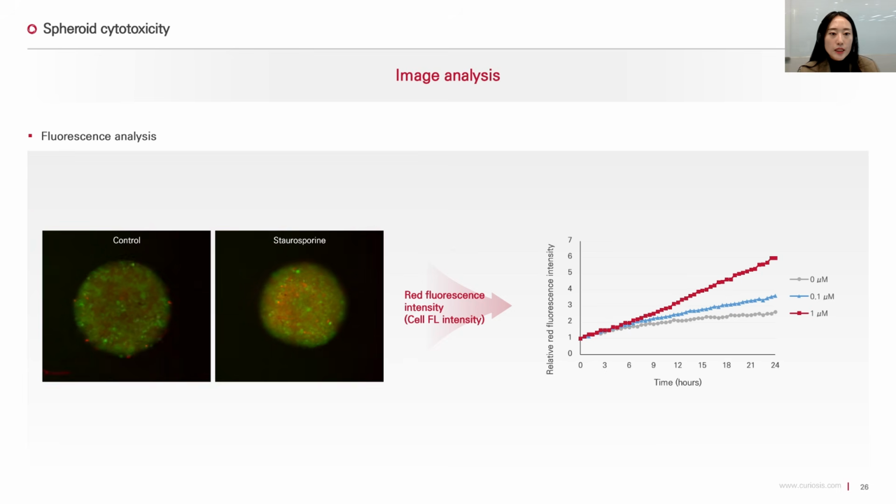Here you can see the quantitative result from the fluorescence analysis. Just like what we saw visually, the red fluorescence intensity increased over time, and the higher the drug concentration, the faster and stronger that increase becomes. This confirms that staurosporine induced time- and dose-dependent cytotoxicity in the spheroids.